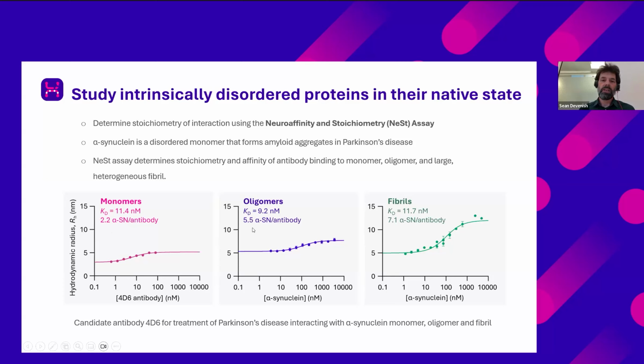So we can see that as we are increasing the size, we're obviously having a number of alpha-synucleins where the binding epitope is buried inside these macromolecular constructs. But it's also worth noting that these actually still represent quite high binding ratios compared to those seen for some other oligomeric type species.